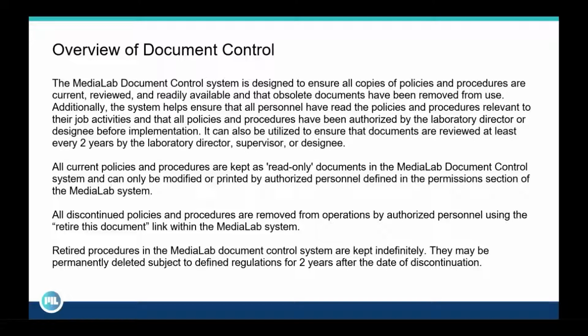It's also used to ensure that documents are reviewed at least every 2 years by a CLIA lab director or designee. All of your current documents are kept as read-only, which means they can only be edited by certain users with the author administrator permissions. Any discontinued documents are removed. Your end users will never see those, but they are kept indefinitely in MediaLab, so admins can always access these retired documents when they want. MediaLab never gets rid of retired documents. We don't delete those. That is up to you as the customer.